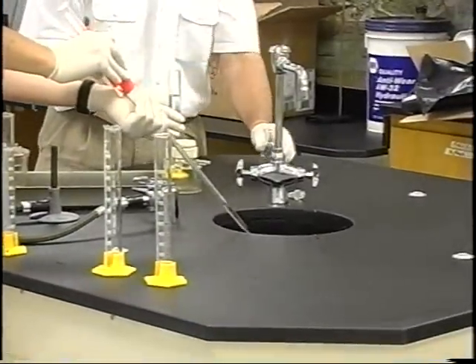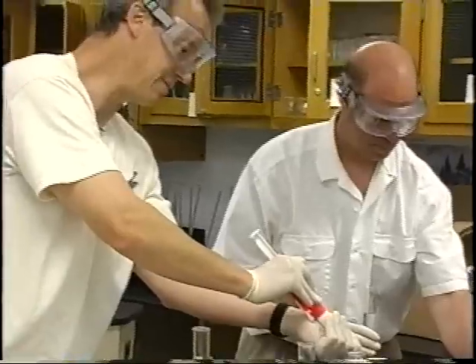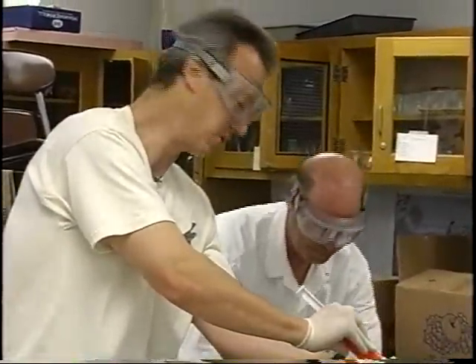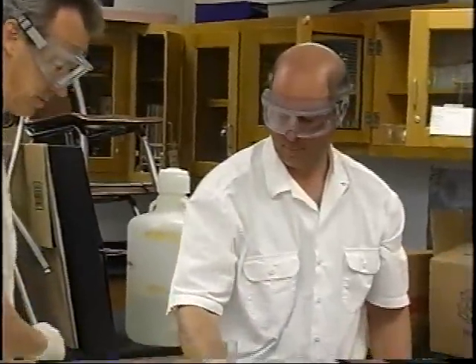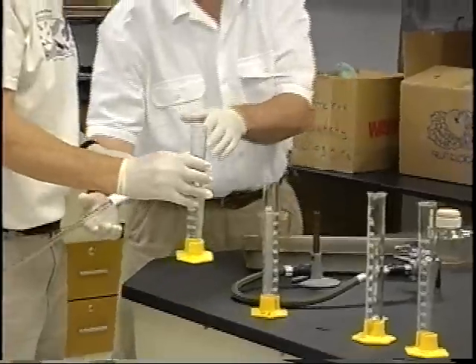You're actually probably going to be done with the sample. Don't throw it away. Don't put it down the drain yet, but just put it aside. We probably have all the river water we're going to need, and we'll explain that to you in a second. So thank you.